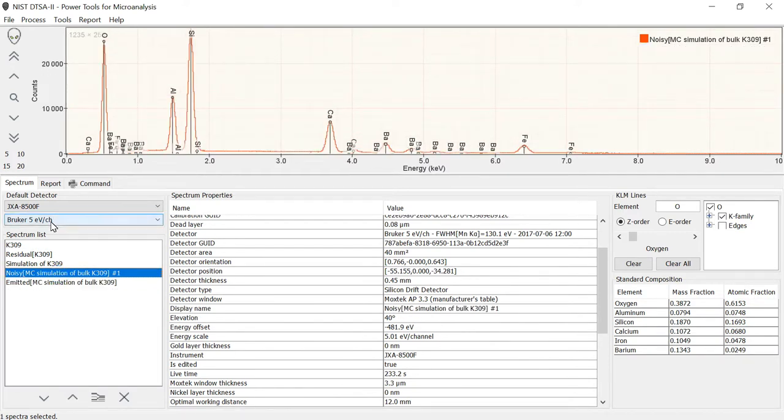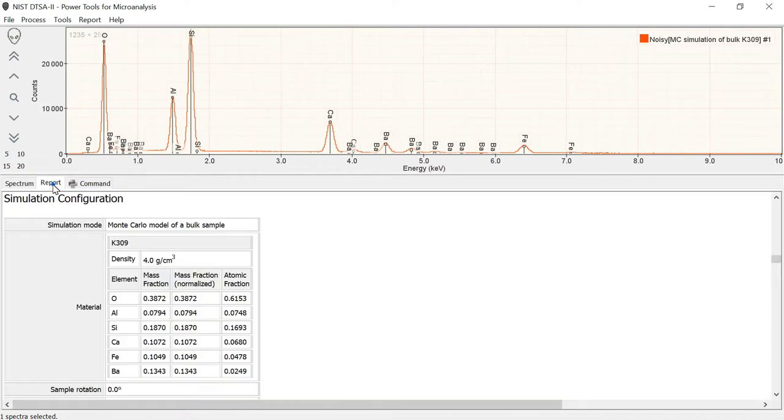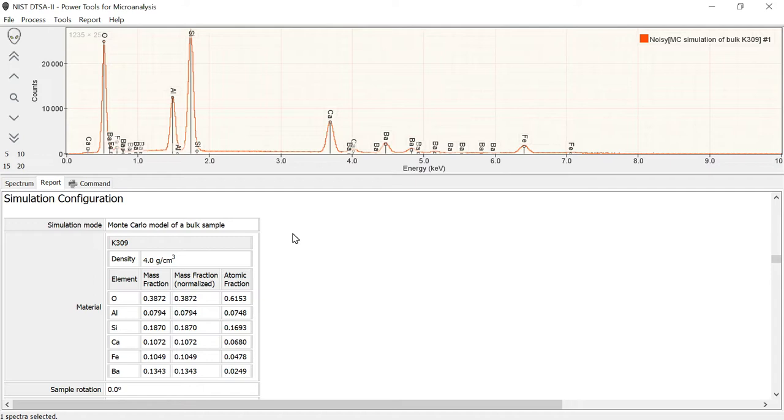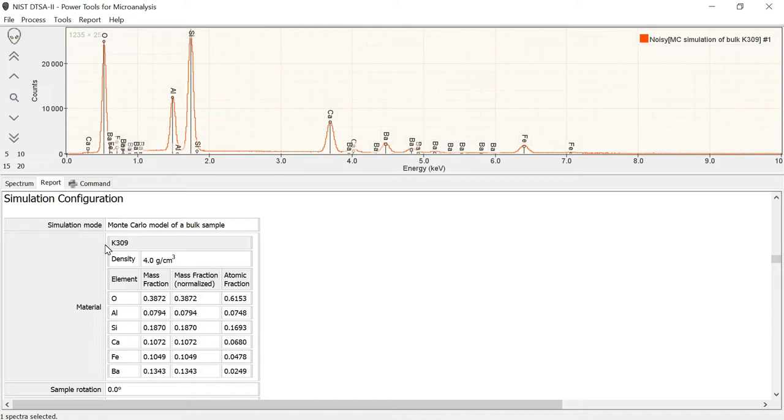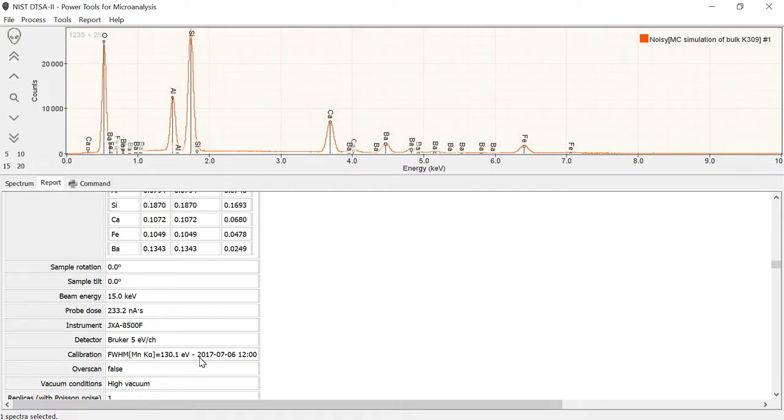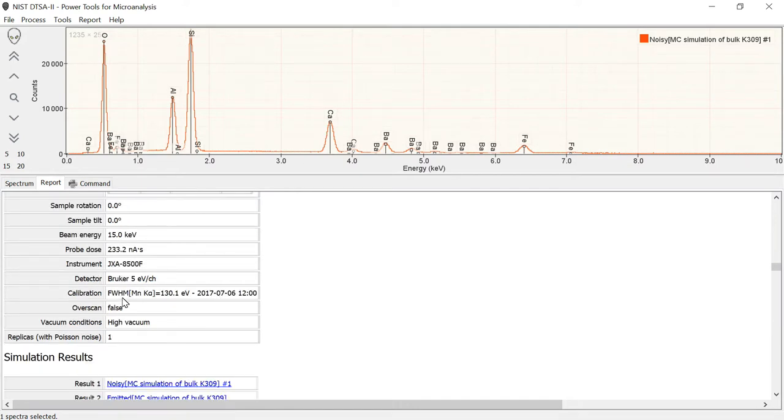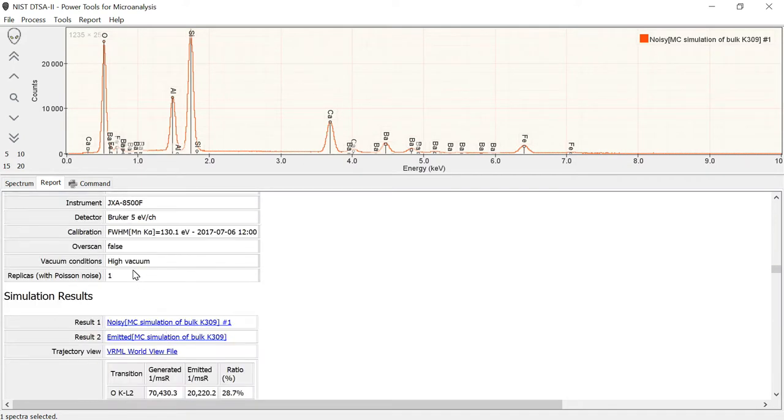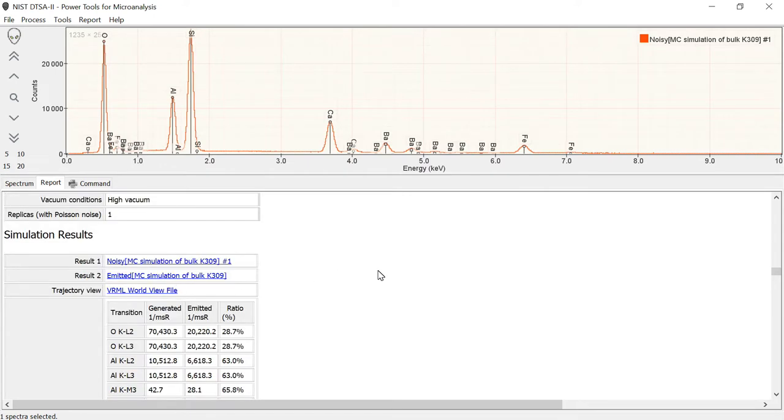So we got the primary outputs of these two spectra. We're going to go and look at another output, which is the report. And again, like in the case of the quantification, you get a very complete report of both what you did, the assumptions that went into the calculation, and then outputs. So simulation mode, Monte Carlo model of a bulk sample. Here is the definition of the model of the unknown that we're modeling. Mass fractions, density, all that good information. Some descriptors that tell you about the conditions that we modeled. So the probe dose, the beam energy, the detector, whether we did a variable pressure.